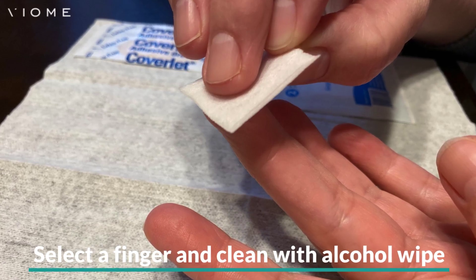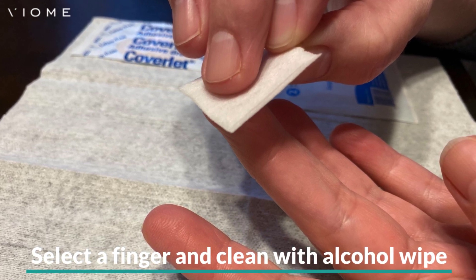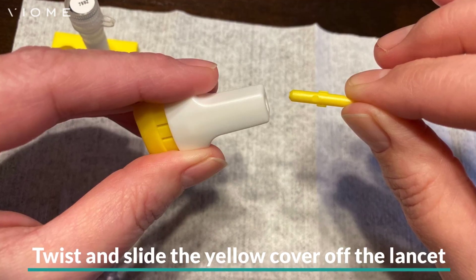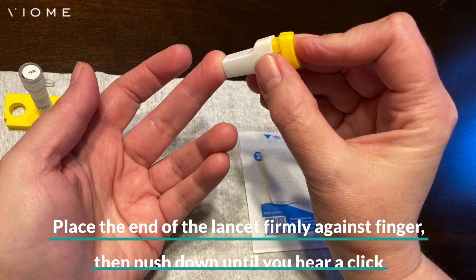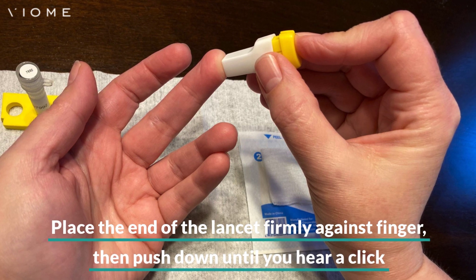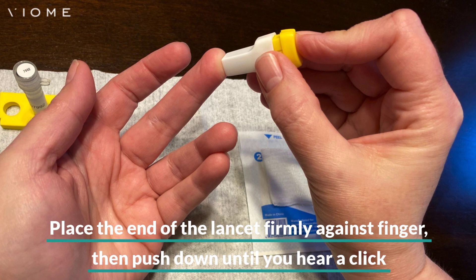Select a finger and clean it with an alcohol pad, making sure to let it completely dry before proceeding. Twist and slide the yellow cover off of the end of the lancet. Place the open end of the lancet firmly against the side of your finger, avoiding the fingertip.